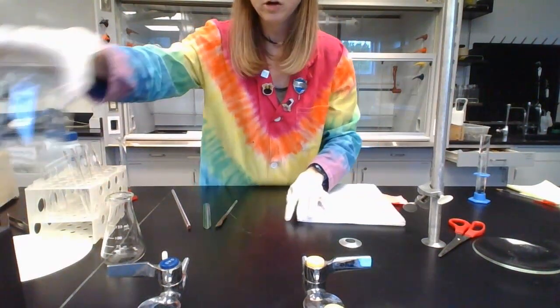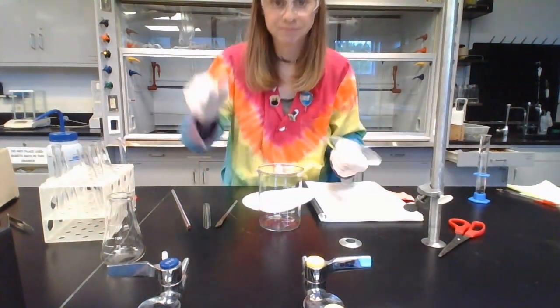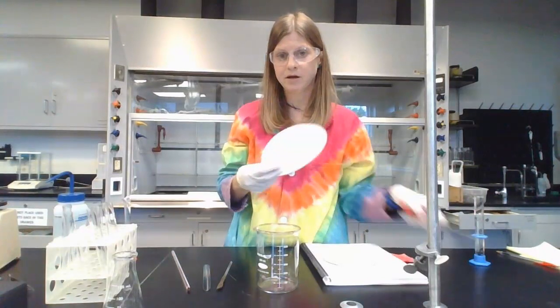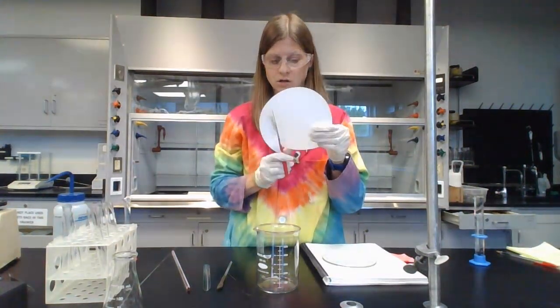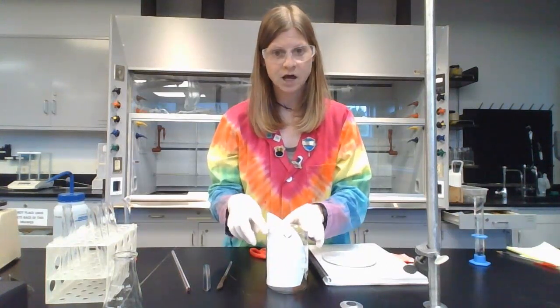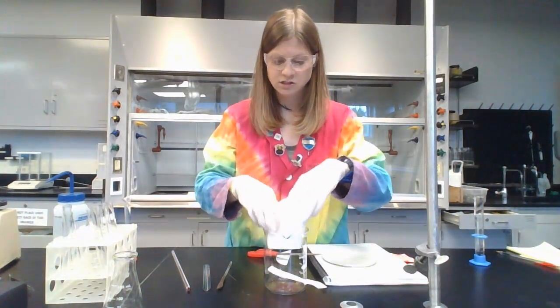So you're going to need a 600 milliliter beaker, a piece of filter paper, and a different watch glass. Not the watch glass that's in the oven, but another one. Sorry. So what we're going to do, this is our developing chamber. This is where the TLC is going to happen. We're going to take a piece of filter paper and a pair of scissors, and we're going to cut a flat edge along the filter paper. Our goal is to have that flat edge at the bottom of the beaker, so where the filter paper does not stick up, but it's the perfect height. Well, I did not accomplish my goal, so I'm going to cut some more off until it's just the right height.